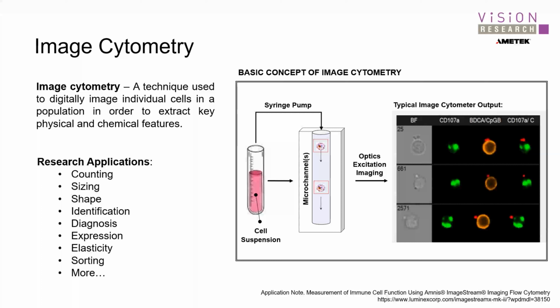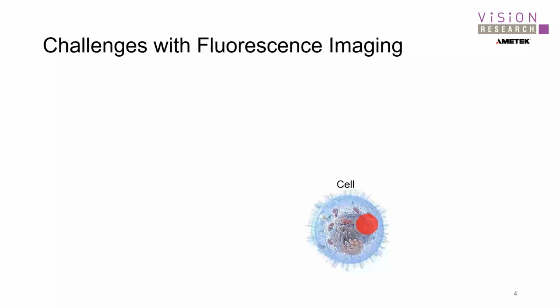And if you look at the academic literature, there are a lot more examples of what people want to do. All right, so from the standpoint of imaging, if we think about fluorescence imaging, we want to learn why it's such a struggle to go to high speeds when imaging.